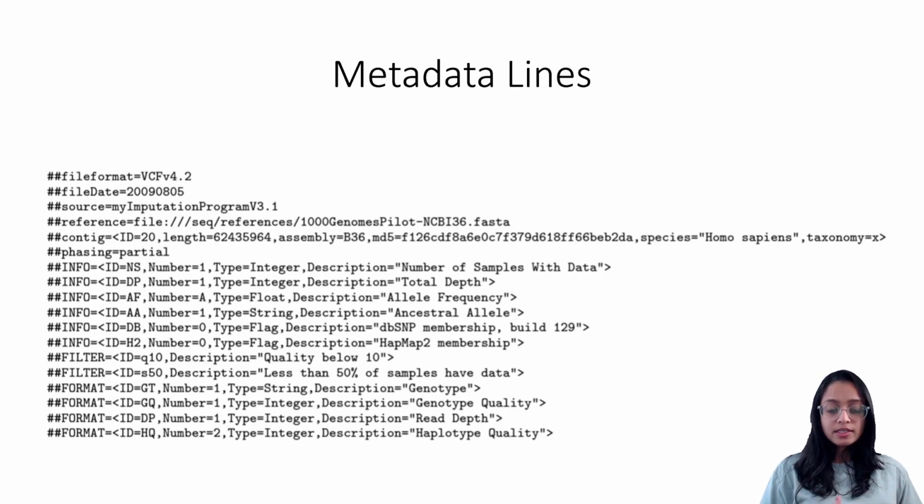the genotype quality, the read depth. All of those pieces of information will be present as annotations and a value, and the descriptions of the annotations and the values expected, the format of the values, are described in the metadata section with the lines starting with format. It's okay if it's not very clear as to what the lines starting with info, filter, and format mean.